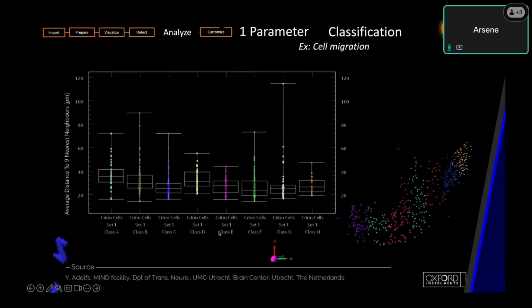And for each class, we can not only get a cell count, but also get a sense of their density per class, for example, using the statistic named distance to nearest neighbors. So we can easily compare class densities within this image and later across multiple images.